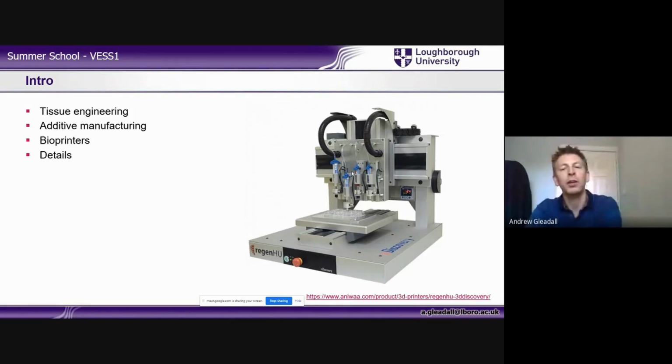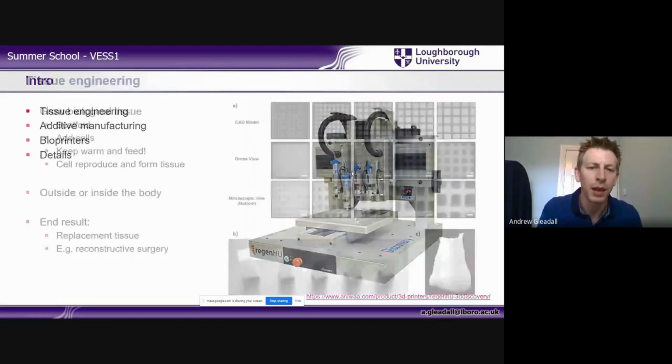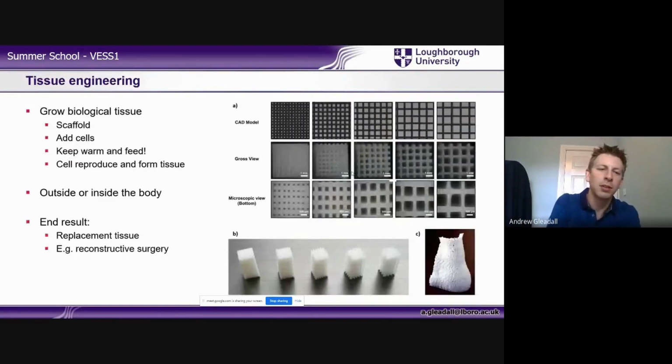And then talk in more detail about bioprinters and show a couple of videos from a bioprinter manufacturer about their system, talk through that, and then go into the details of how those systems actually work. So tissue engineering typically involves a scaffold.